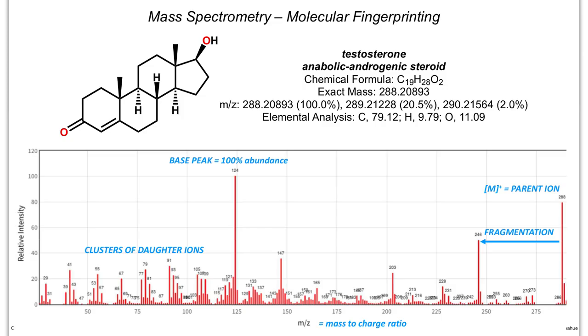So hopefully you're still with me at the end of this little journey here on testosterone, in understanding that from that molecular ion 288, we were able to come up with that molecular formula. And again, through that, we did have to make some assumptions about the heteroatoms present. And really the ambiguity was, is it oxygen? Can we run with that?